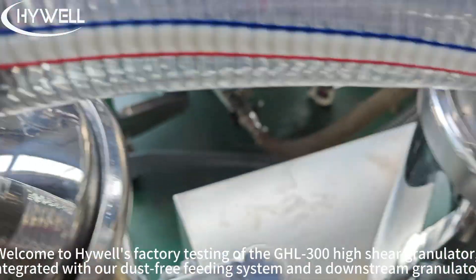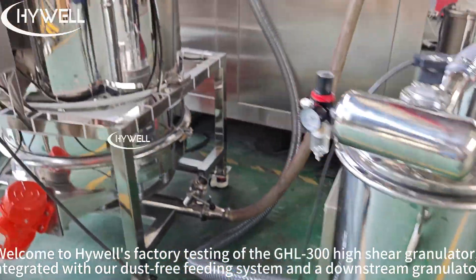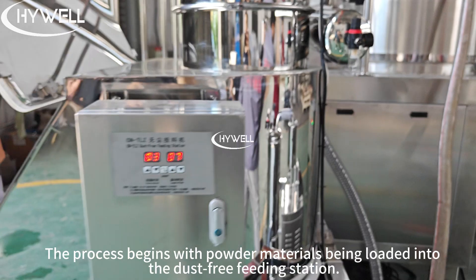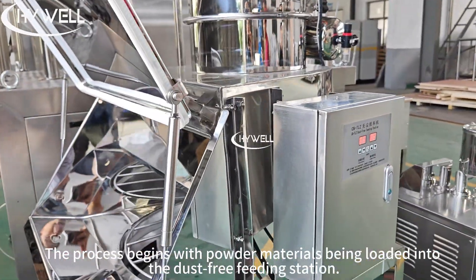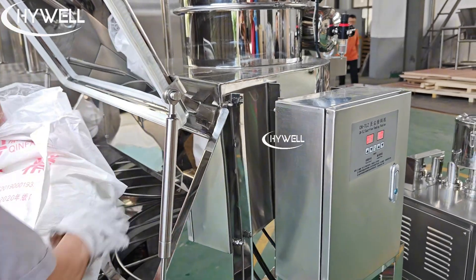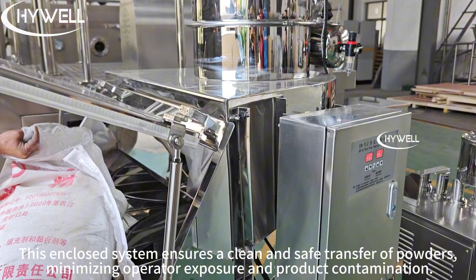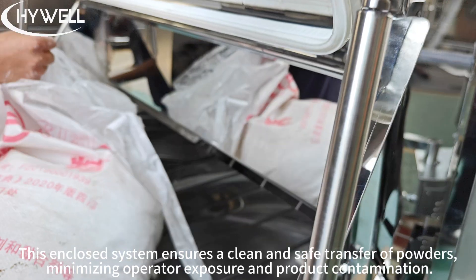Welcome to Hywell's factory testing of the GHL300 high-shear granulator, integrated with our dust-free feeding system and the downstream granulator. The process begins with powder material being loaded into the dust-free feeding station. The enclosed system ensures clean and safe transfer of powders, minimizing operator exposure and product contamination.